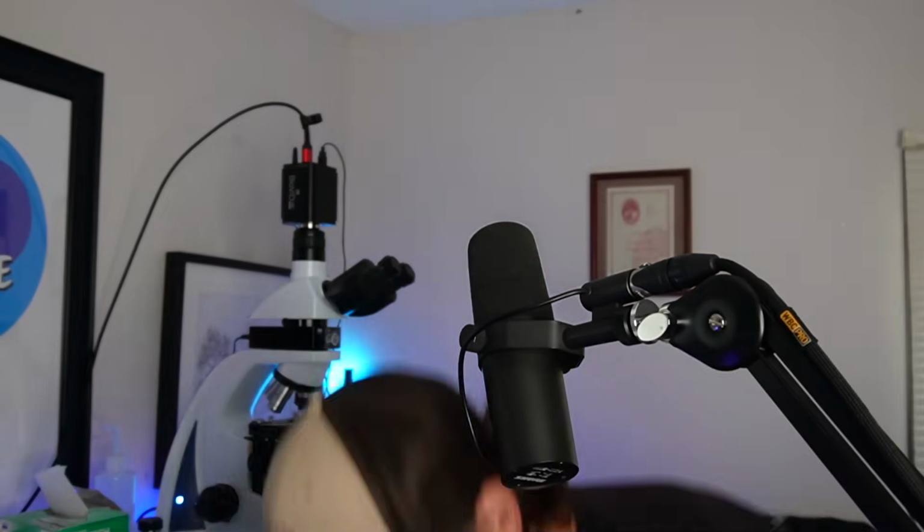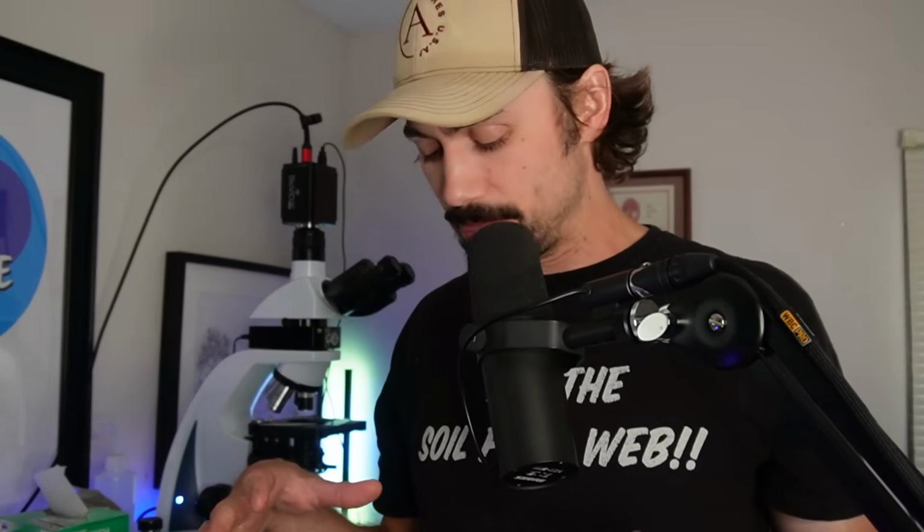I've got this. So that's 5 gallons. The top is expanding and rising because it's so active. And I was showing this brew, it's only a week old, to my regenerative soil microscopy class. They're in week 17, and so they're doing biofertilizers. And it's all about establishing a baseline, a point of comparison.